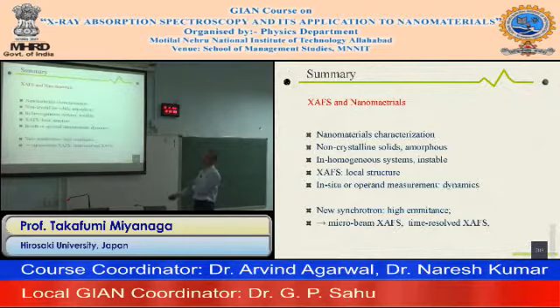Using X-rays and detection of X-rays, in situ or operando measurement is applicable. In that case, we can pursue dynamic systems, such as the production of nanomaterials or changes of nanomaterials, and chemical reactions using nanomaterials, for example, batteries.